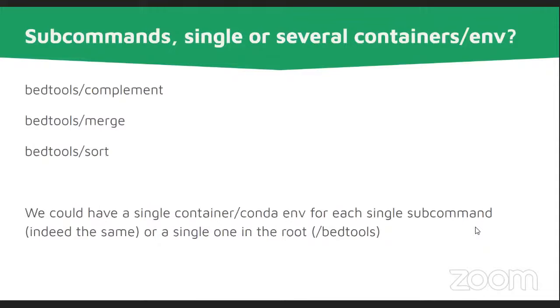So, for example, if you're using BWA to index, you probably don't need SAMtools. But if you're doing BWA to align, then you probably do want SAMtools. So you don't want to call both of those containers the same thing when they're different. Yeah, good point. But that does mean, I guess, on the downside there is that we'll be downloading loads of containers, right? Or more than we need.